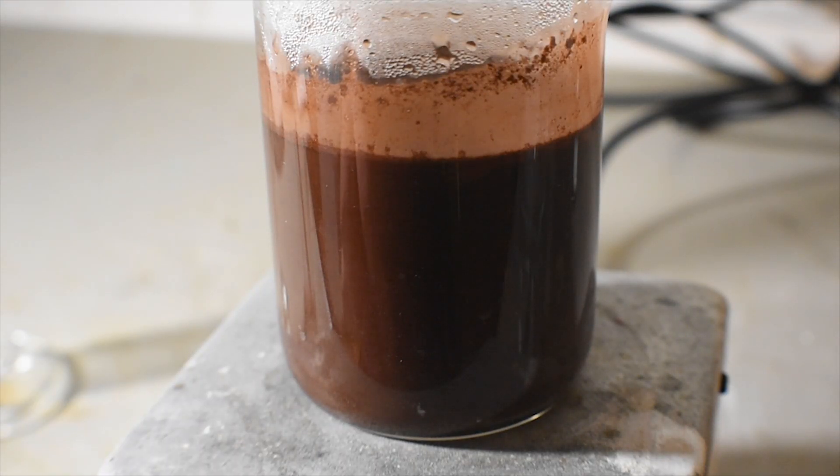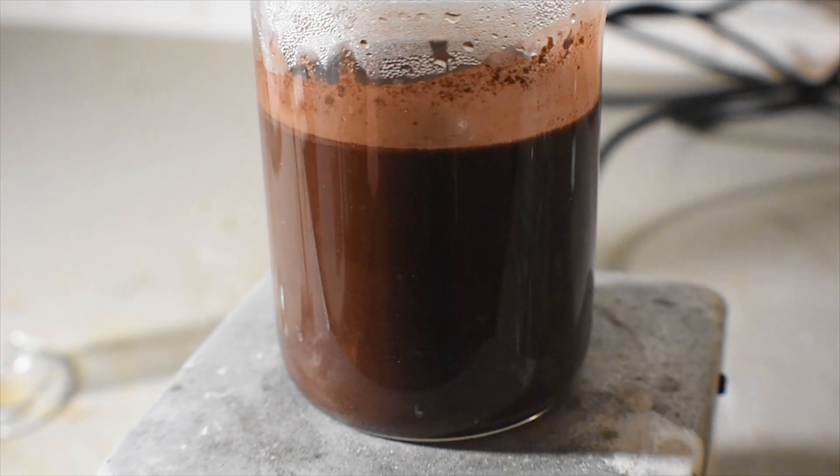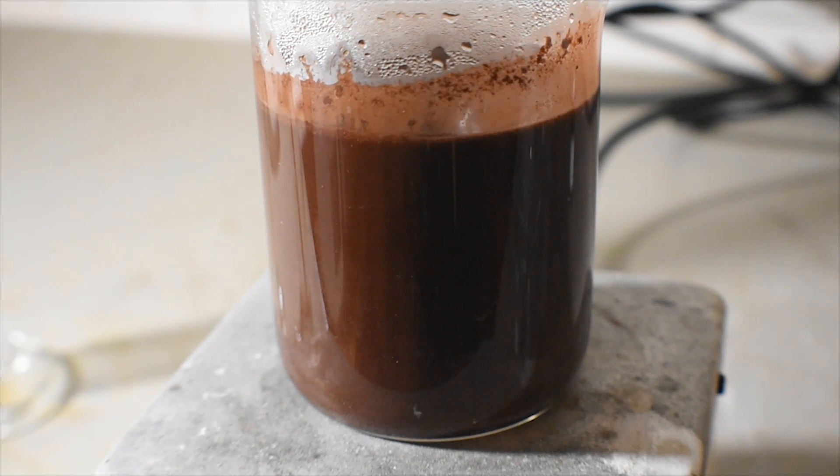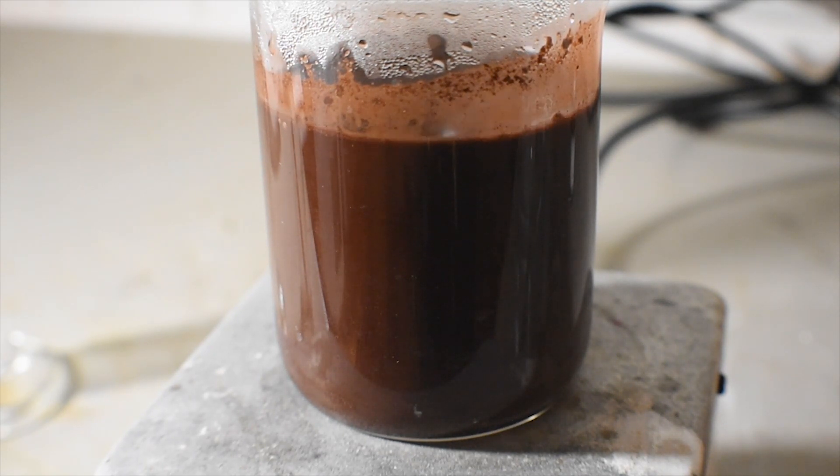Once all the persulfate has been added, we are left with a fine chocolate brown precipitate of our silver two complex. This can then be filtered off and dried.